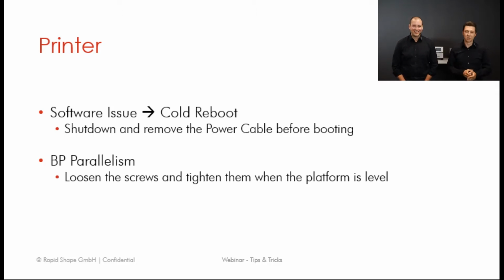Inevitable. Yes. So once you've done this and the issue is still appearing, of course, directly get in contact with us. No problem, we will try to solve it as soon as possible. But if you just do the cold reboot in the beginning and it's working, the customer can continue working. And this is, I think, the best thing you can do. Do a cold reboot. If the customer can work again, we can still have a look at log files and so on afterwards, but the customer's work is not interrupted. And you can still contact us afterwards. We will have a look and see if we can figure out what was going on. But the customer is in this case priority number one. So do a cold reboot and maybe all the things are already solved.